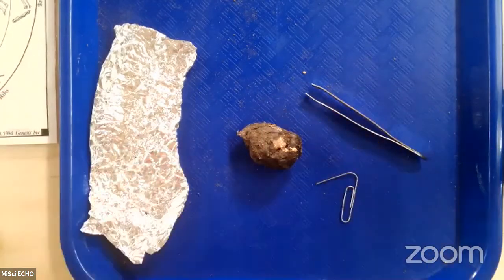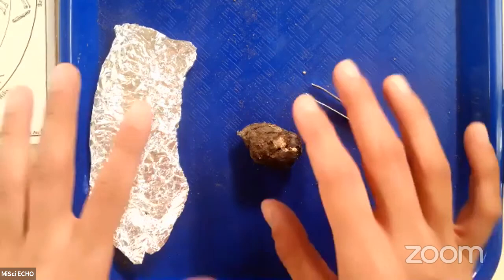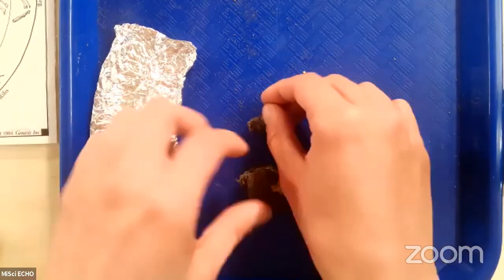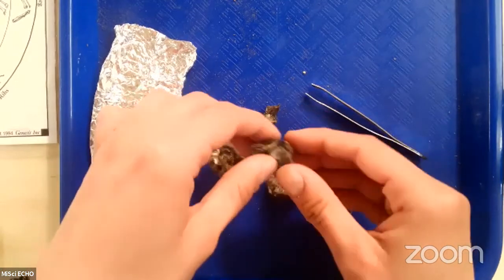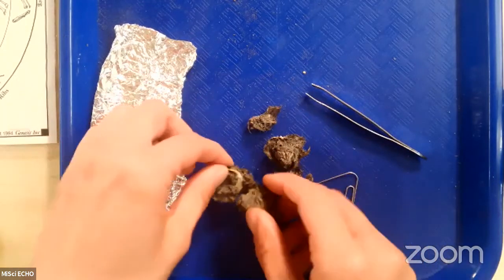If you ever get to do this at school, you can certainly do this with your own two hands, which is what I'm going to do here today. If you think that's gross, that's okay. You could certainly wear some disposable gloves if you ever had the opportunity to do this dissection. But again, it is not necessary because when we purchase them from a scientific supply company, they come to us completely sterilized. So no reason to worry.